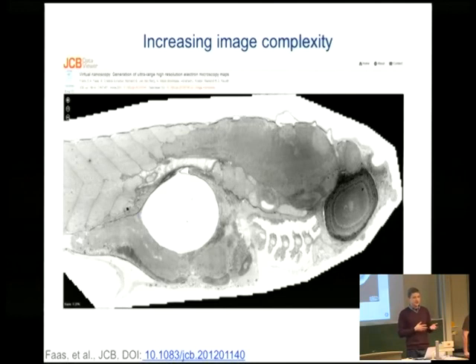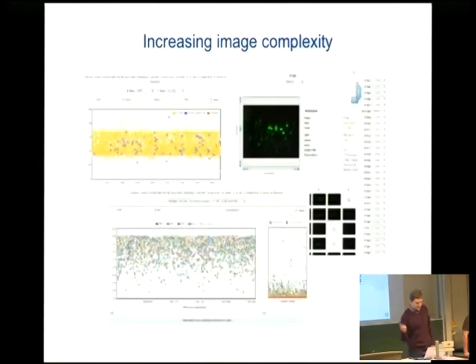There are many other examples like that, like the Stowers data repository. Many academic institutions work on top of our open source project and adjust it to their specific needs. I also mentioned that multiple modalities in images come from the fact that there is also metadata attached to this image. So here's an example of gene phenotyping, which has to go along with the image itself. The image without the specific data being presented this way is basically half of the value of the whole result.